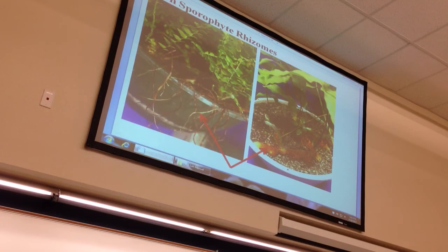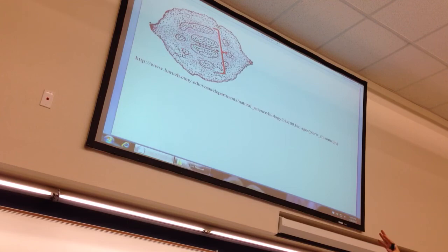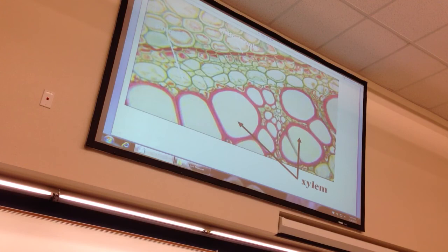Then you get the full-sized plant. This is the rhizomes we talked about. Big or small. Take and cut a section through the rhizome. Then you have, this is indicating, yeah, it's vascular tissue. Notice the stele is different. This is a siphonostele variation of it. But I didn't ask you to know that. I was asking you to know it's vascular tissue. Can you just say stele? Stele, or vascular tissue. In this case, it's stele. And then this is just an enlargement that shows you recognize the xylem. Is it lignified? And then phloem can be up here. Phloem can be up here. Now phloem.